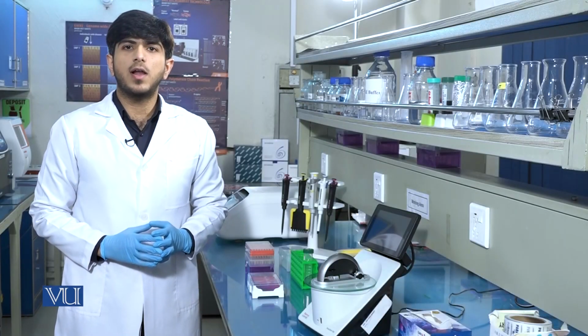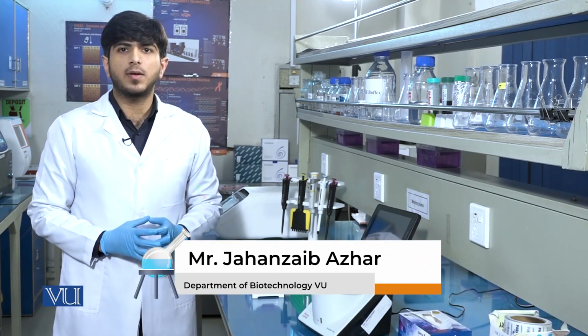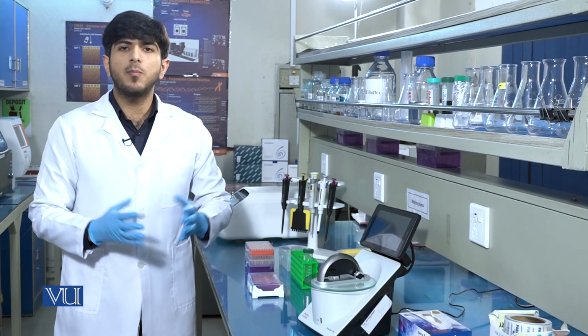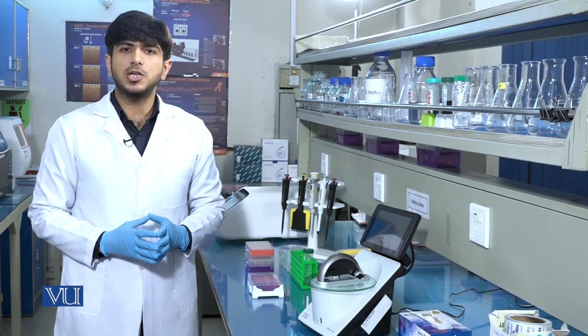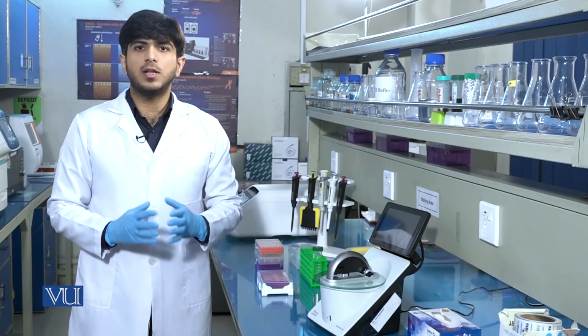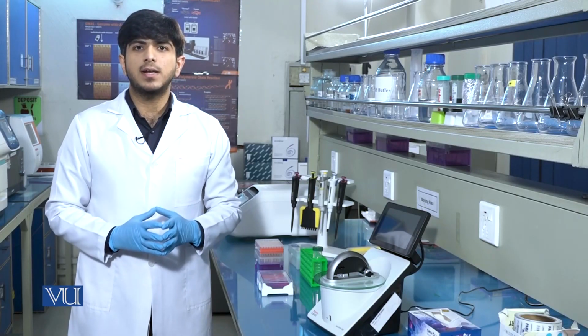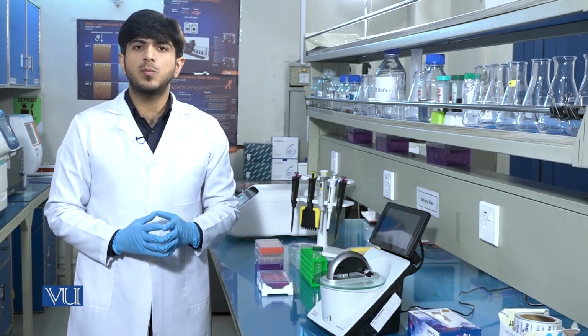Quality assurance and quality control are critical while working in the molecular biology laboratory. Before proceeding to downstream applications like PCR amplification, molecular cloning, sequencing, and other techniques, we need to measure the concentration of extracted DNA. So in this practical, we will demonstrate how to measure the concentration of DNA in a sample using a nanodrop UV visible spectrophotometer.